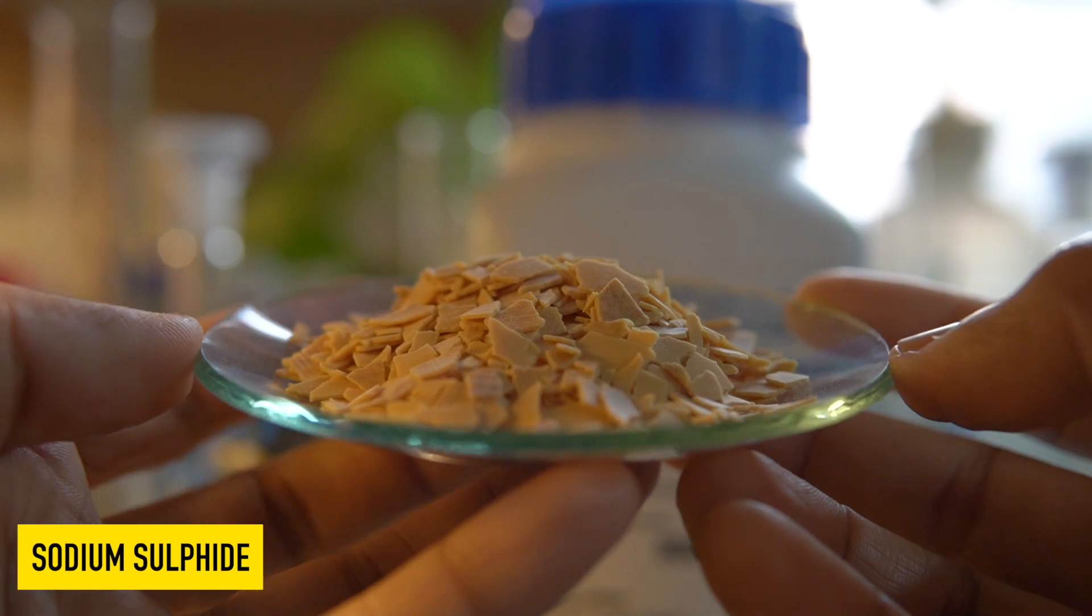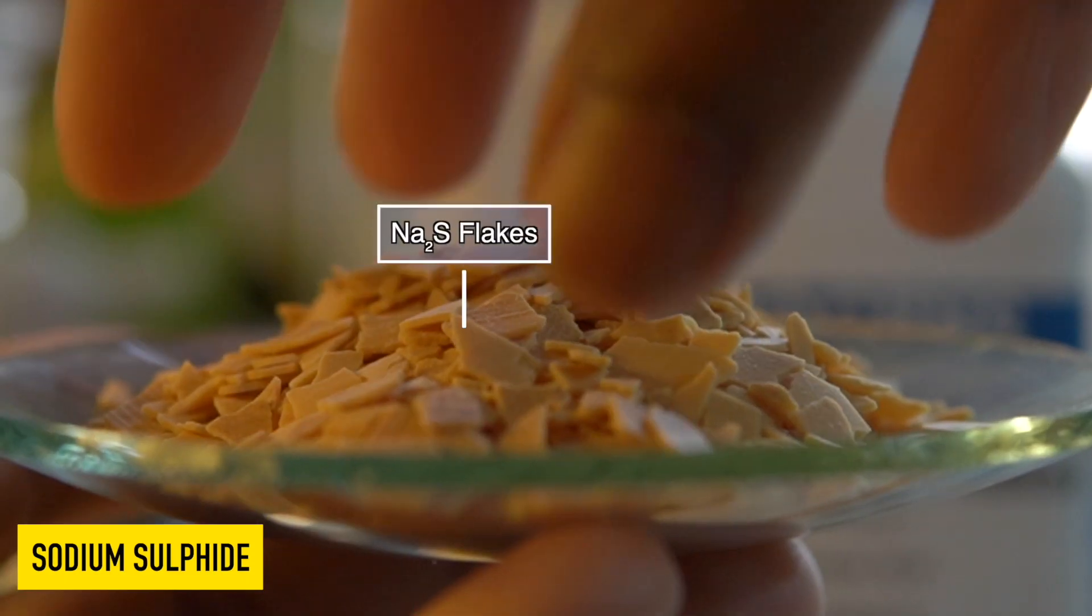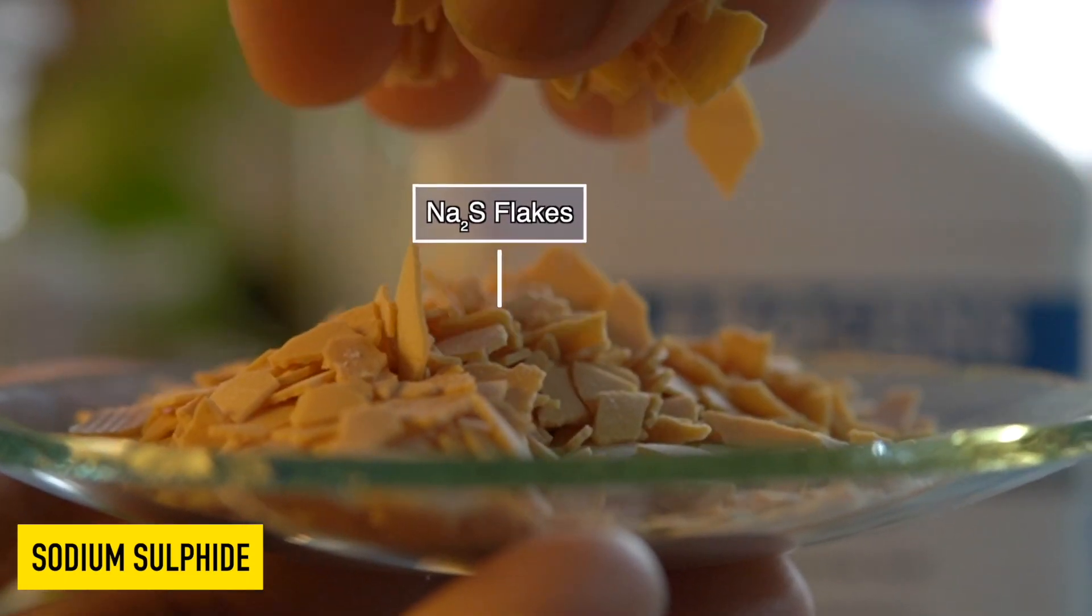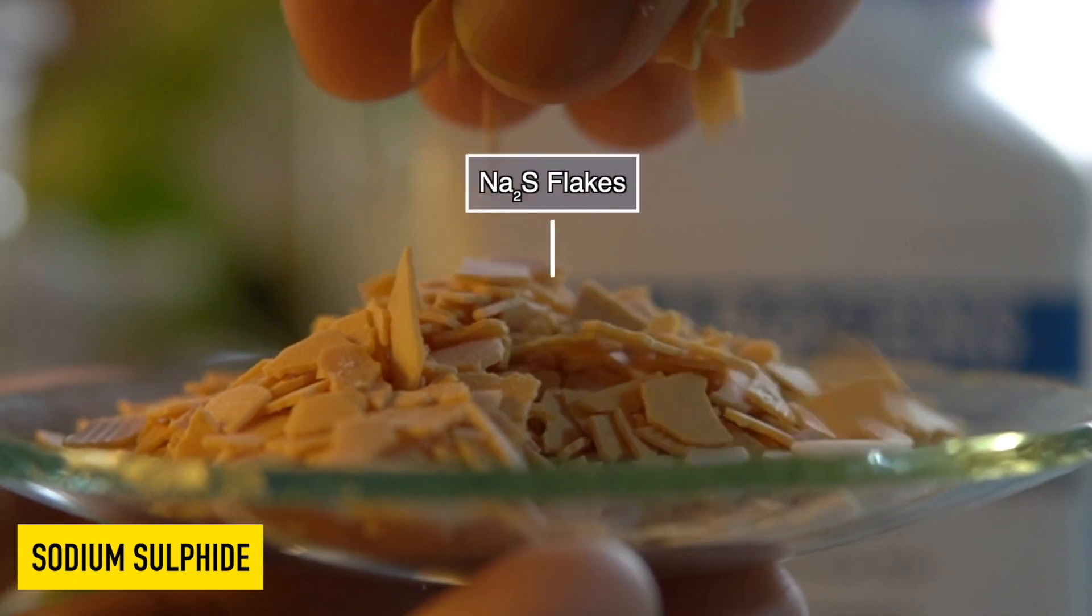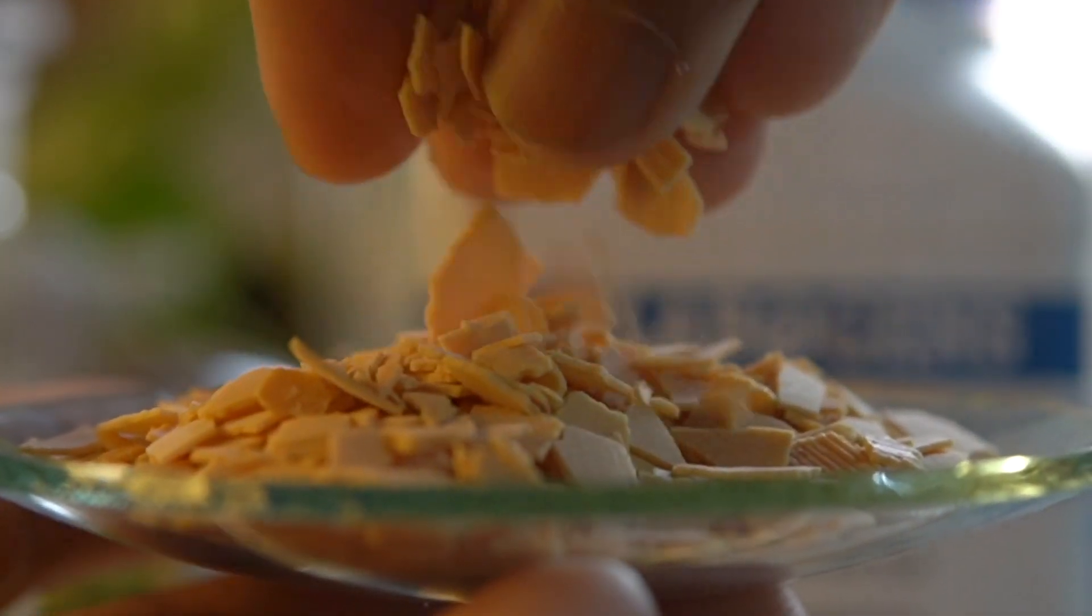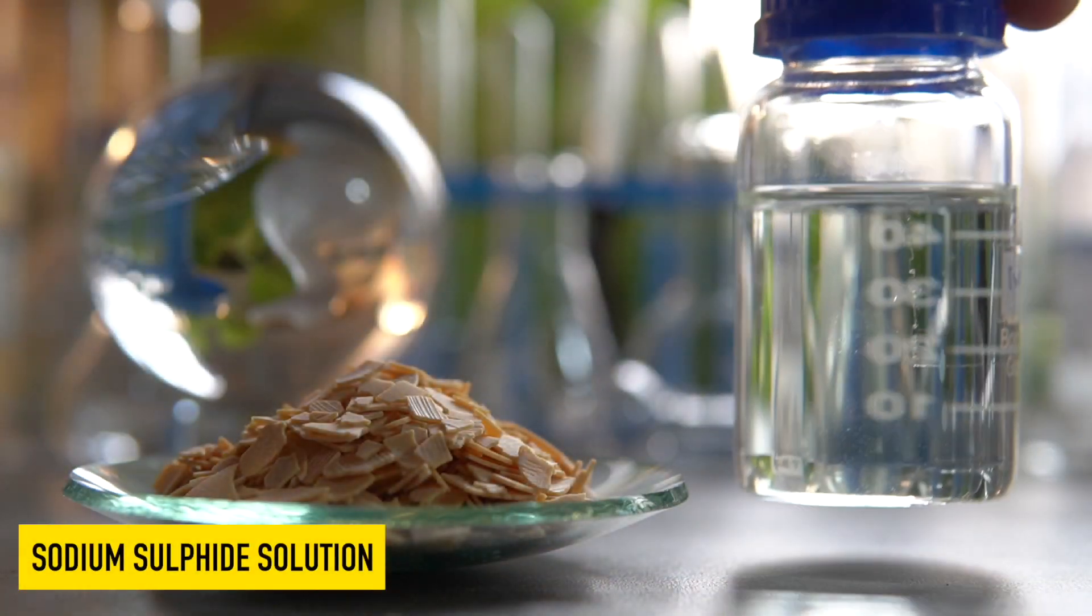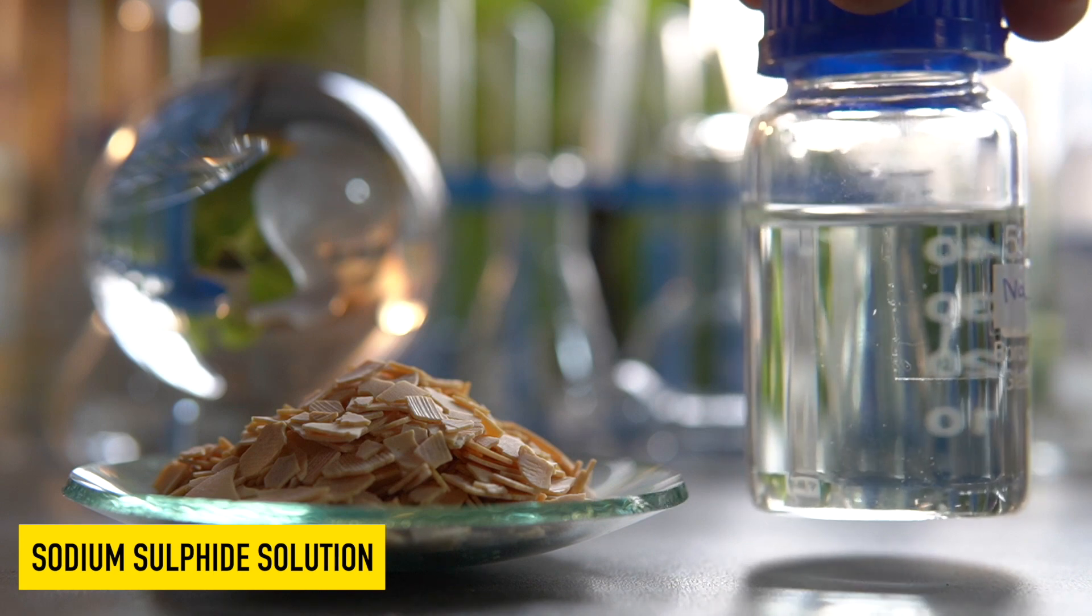These are sodium sulfide flakes. They are slightly yellowish in color and highly soluble in water. They can easily dissolve in water to make a clear colorless solution.